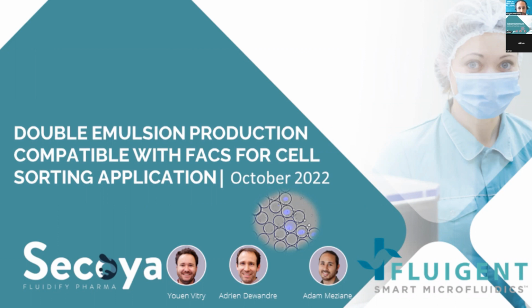And so today we are going to present how we can produce double emulsion that will be compatible with FACS for cell sorting application.